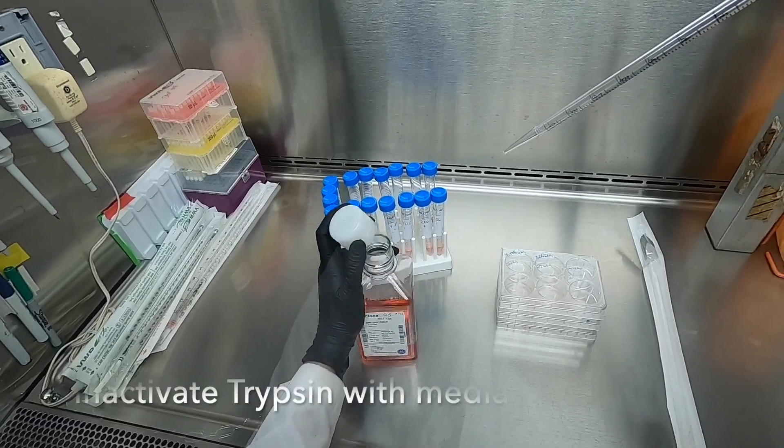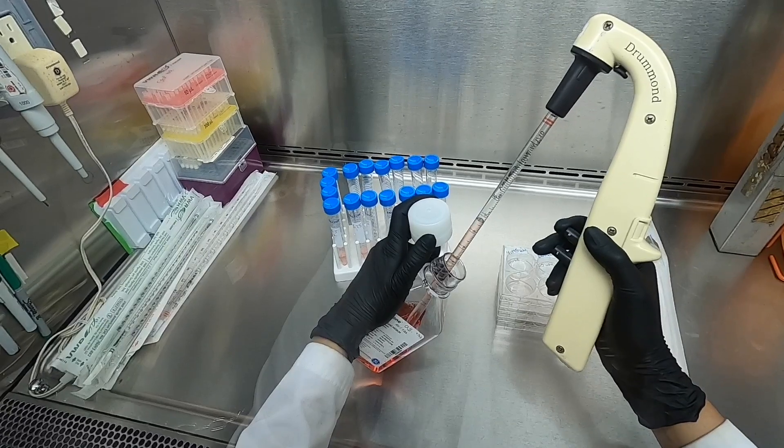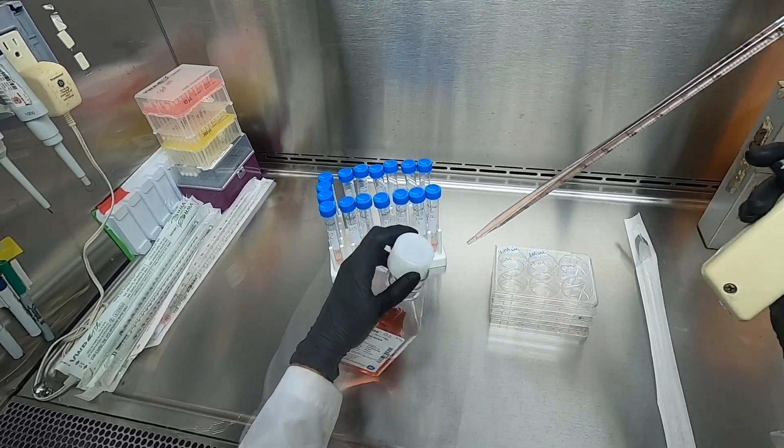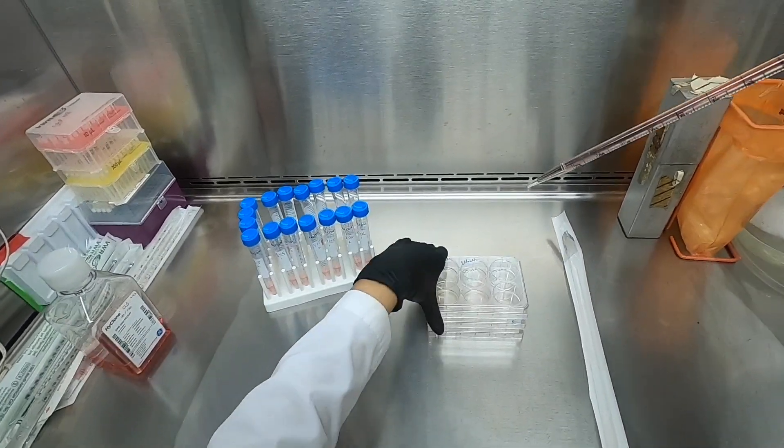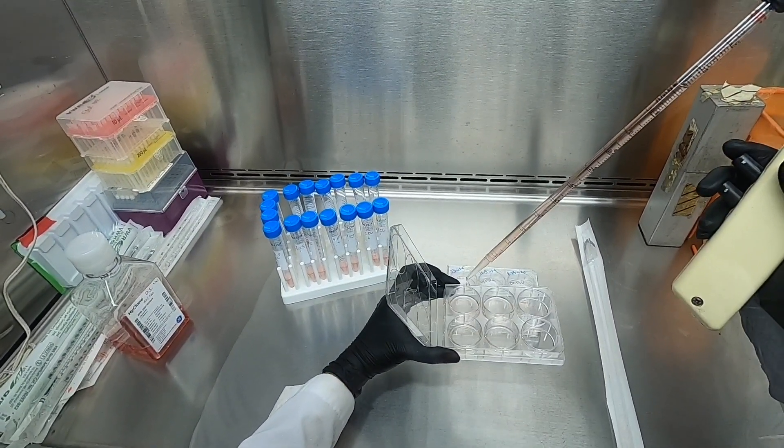Similar to passaging cells, we will be inactivating our trypsin using RPMI media containing FBS. We are adding the media to all wells at once in order to stop the trypsin from working. We will then proceed to work on individual wells.